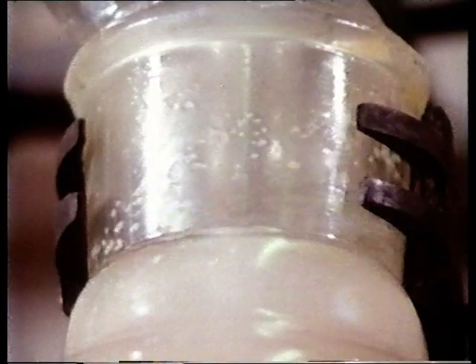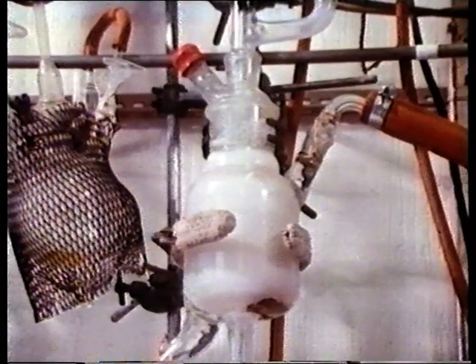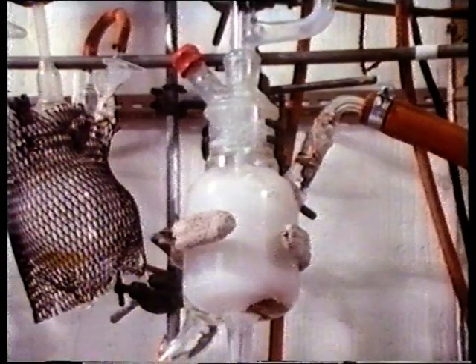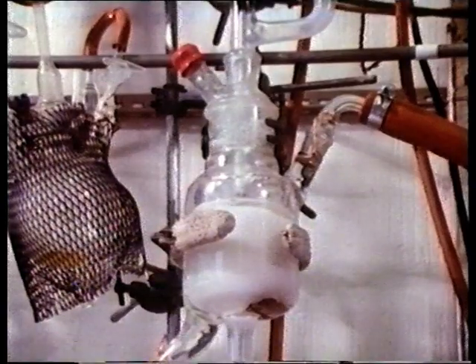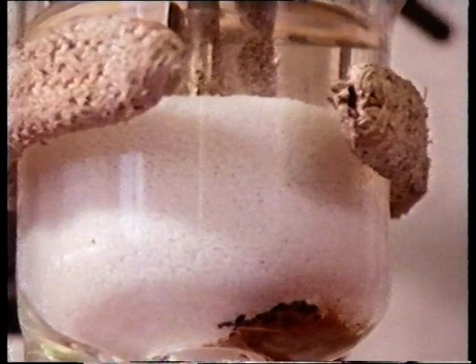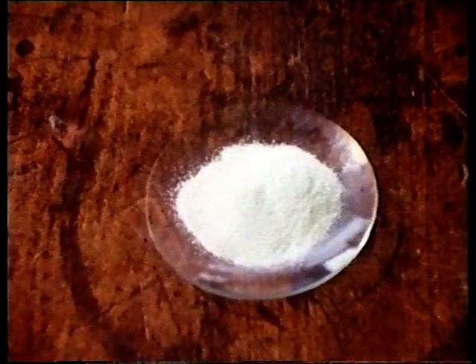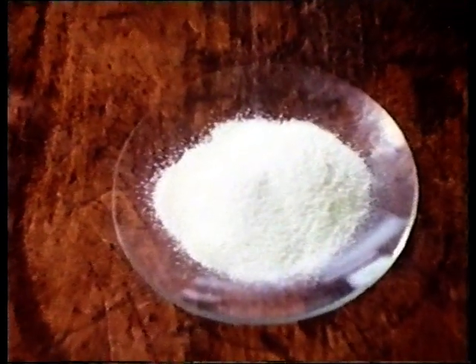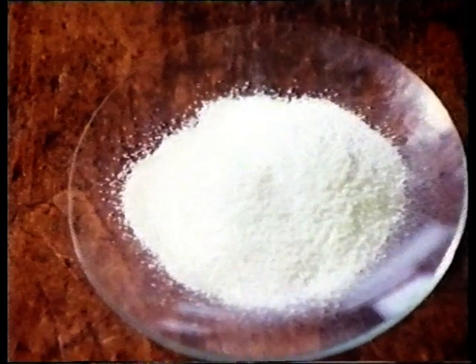In a very short time, the liquid becomes milky looking and specks of a white solid appear. After a while, there's a lot of the white solid. Switch off the stirrer and it settles to the bottom of the flask. This is polyethene, a very important plastic. If it's filtered off and dried, it looks like this. It may not look like a plastic, but after melting it, it can be turned into all sorts of articles.